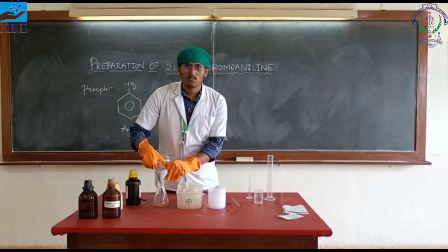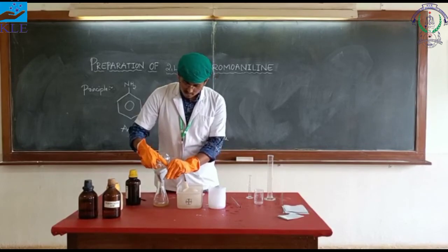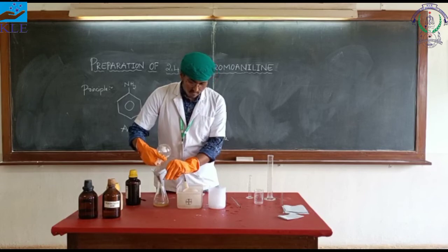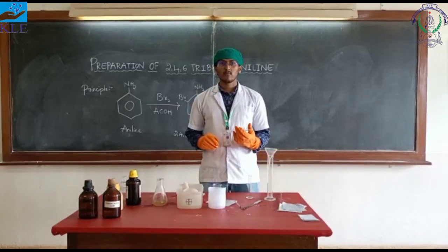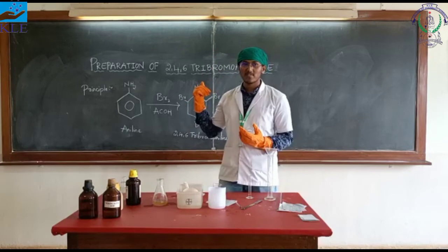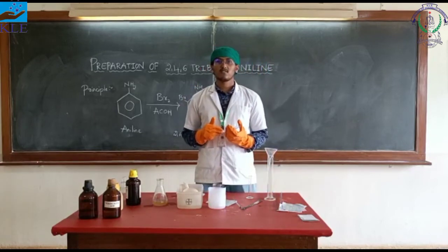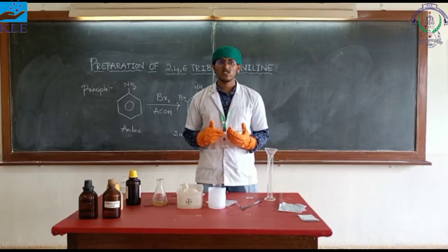The precipitate of 2,4,6-tribromoaniline is formed and now it is subjected to filtration. For filtration we are using a funnel and filter paper. The final product is 2,4,6-tribromoaniline, and its medicinal uses include organic synthesis and as a fire extinguishing agent.